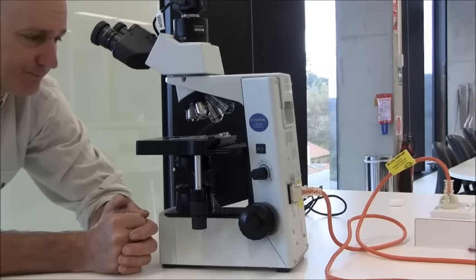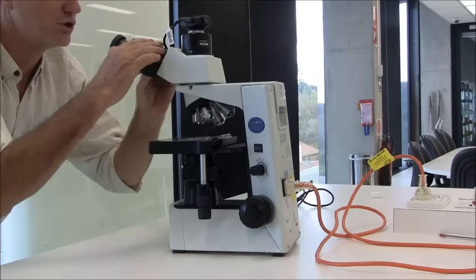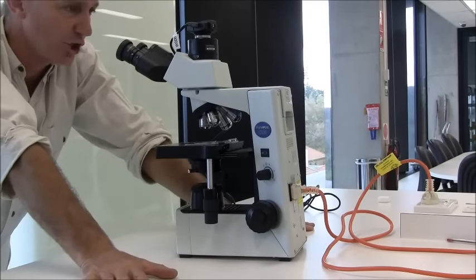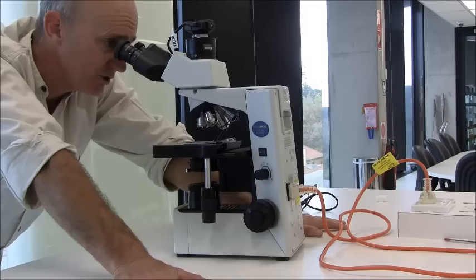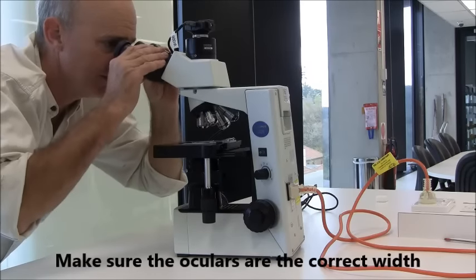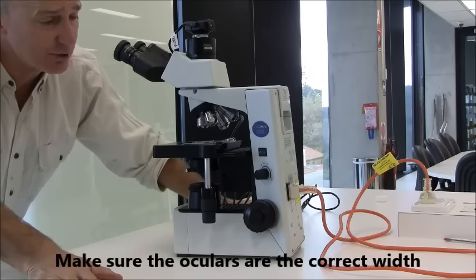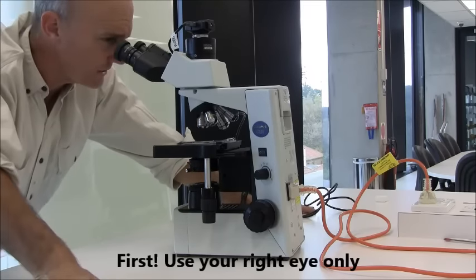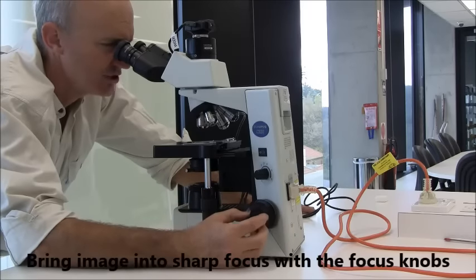The next thing you have to do is focus the microscope for your two eyes. And of course, they are binocular microscopes. They're meant to be used with both eyes to give you the best image. You set, again, the distance between your two eyes. And then, very similar to the dissecting microscope, first of all, you only use your right eye. So looking at the sample with your right eye, get it into sharp focus.